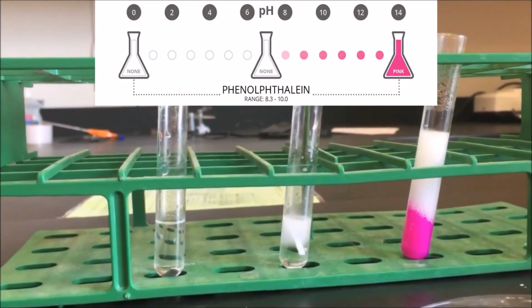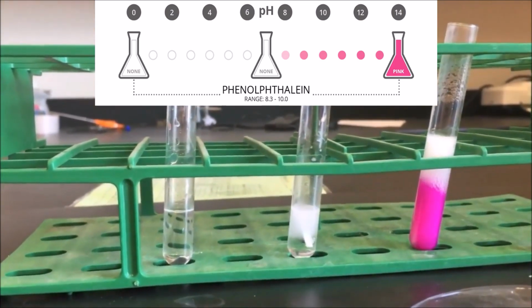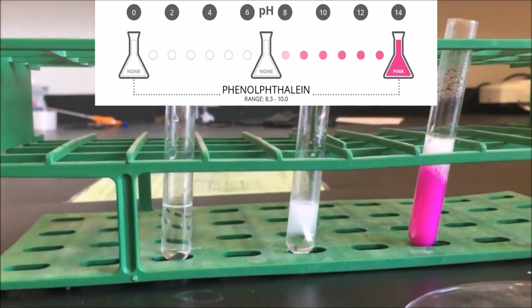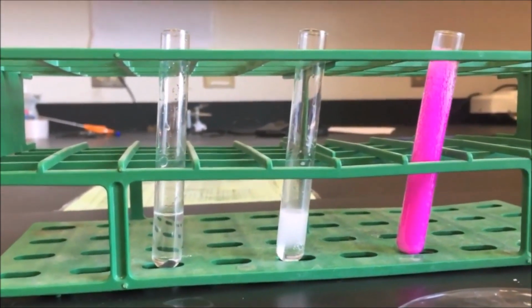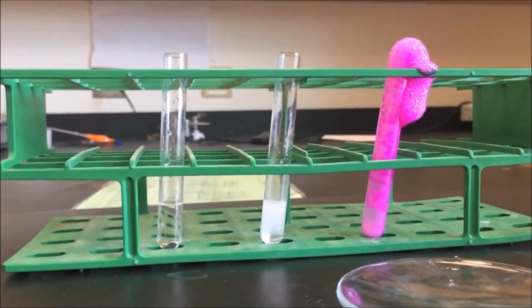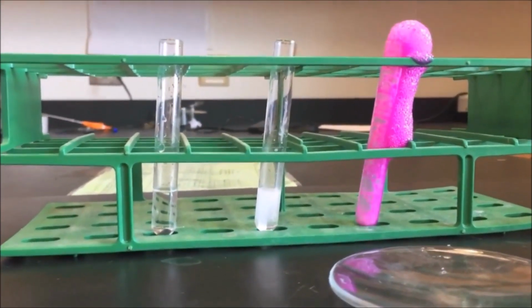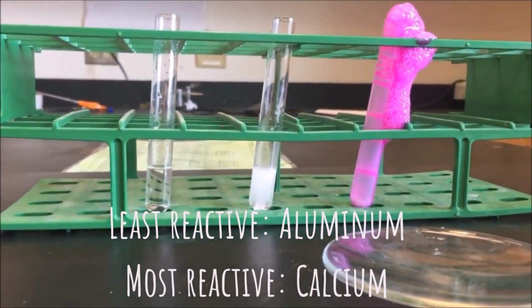The color change is due to phenolphthalein, an indicator that turns pink in the presence of a base. We can see that aluminum was the least reactive metal and calcium was the most reactive metal.